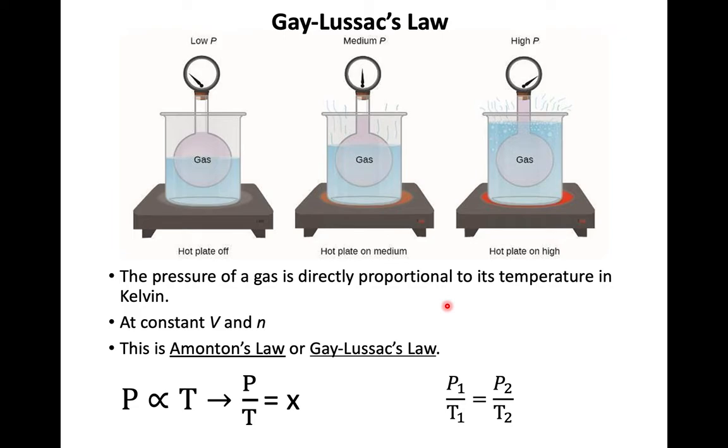Okay, we're also today going to look at Gay-Lussac's law. And this relates pressure and temperature. If we start over here at the high temperature side, we have high temperature, which we're causing by heating the glass with this water bath. And then if we slowly first turn the hot plate down to about half, as we give it some time to cool down, you'll notice the pressure drops. And then if we let this cool all the way down to regular room temperature, the pressure drops even further. And so we see that the temperature and the pressure are directly related to one another.